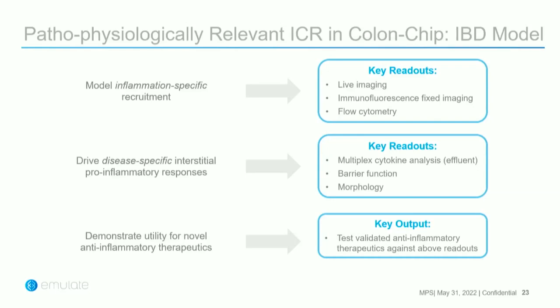Secondly, once those cells are there, we need to show that they drive inflammatory responses, but not just any responses: responses that model the tissue and disease-specific conditions that we're trying to emulate. For that, our readouts are particularly multiplex cytokine analysis of the effluent and barrier function, both capturing critical hallmark features of IBD.